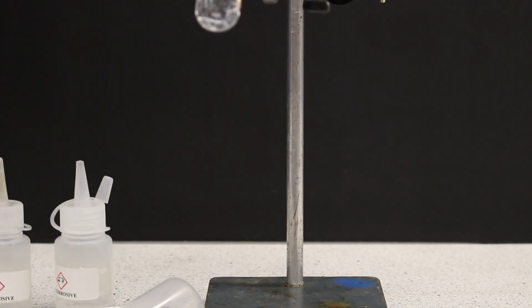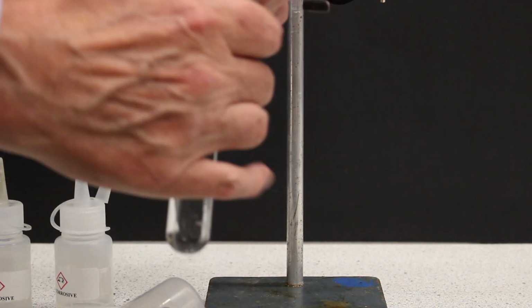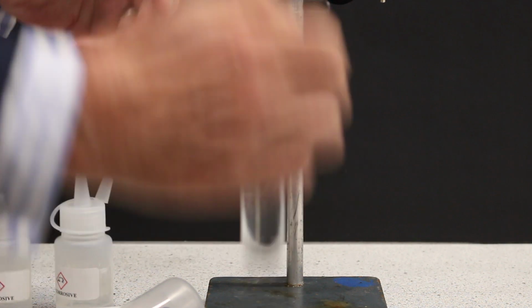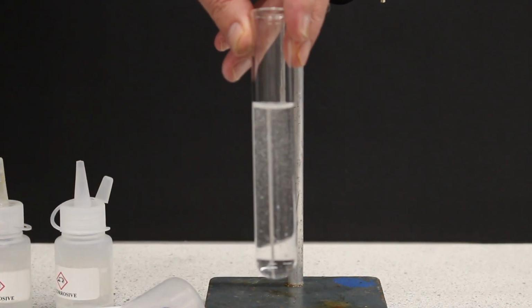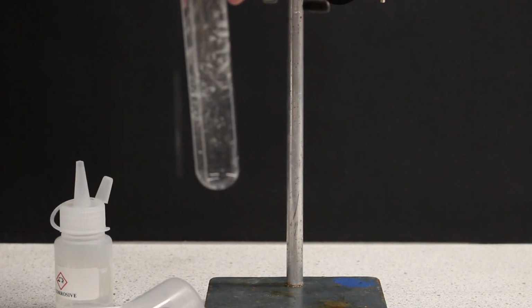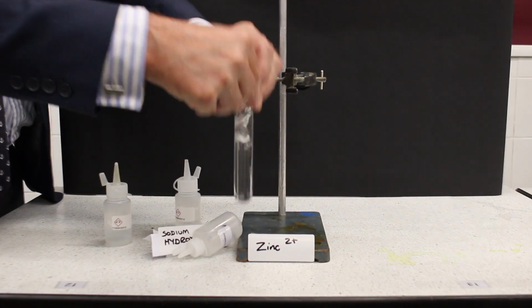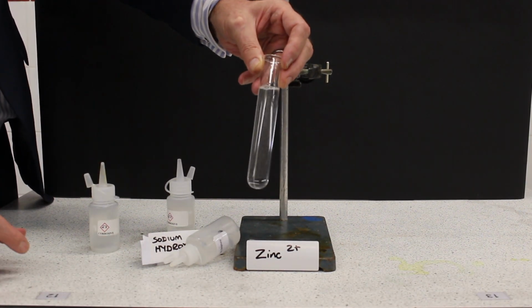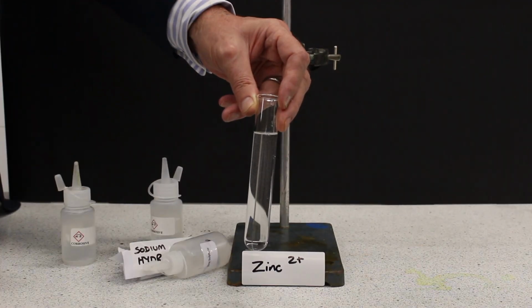So if we shake the test tube, the precipitate is almost dissolved here, and we may need to add a few extra drops of aqueous NaOH just to make sure that every last bit of precipitate dissolves. So we're going to add a few more drops of aqueous NaOH here, and we're going to shake up the test tube, and you can see now that the white precipitate has fully dissolved to form a colourless solution.